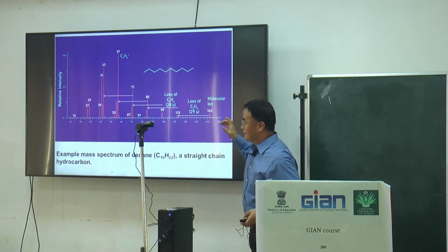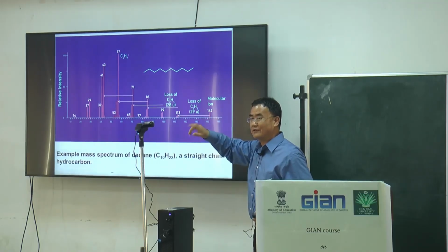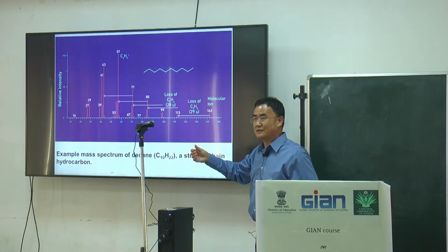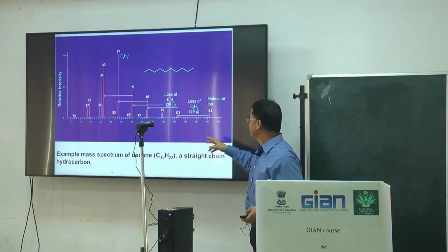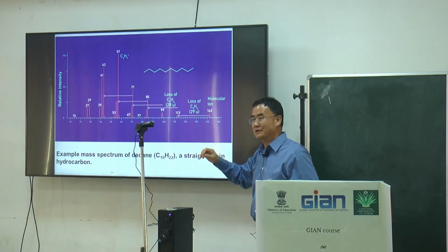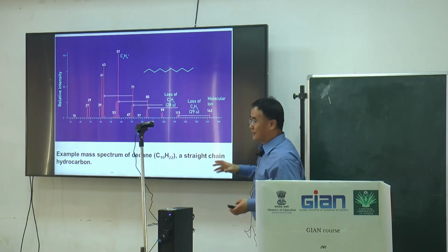Then we know this compound, after electron ionization, goes into the mass spectrometer as a neutral molecule, then gets charged during the flight. There, some parts should be broken down. After ionization, they become unstable, right? They will become fragmented.